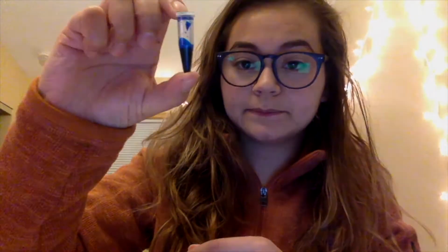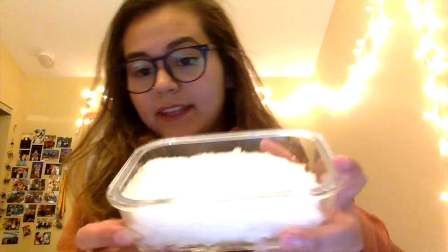You're going to need a microcentrifuge tube, which is a small tube, that has dish soap, and it should be labeled DS. And then the other small microcentrifuge tube with food coloring, labeled FC. And you're going to need the paper clip. From your home, you're going to need a cup, some water, and then you can have a container with snow or with ice. I think snow really helps keep everything really cold. So go outside and get some snow.